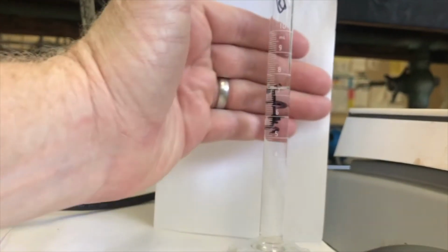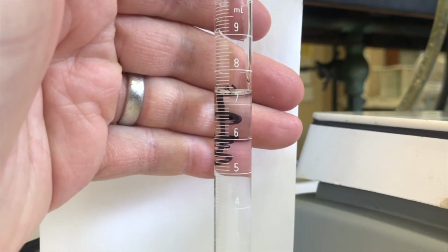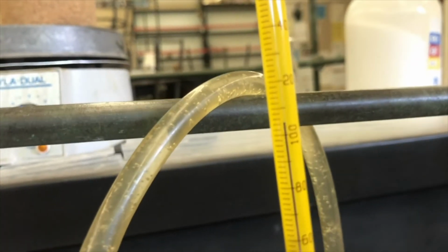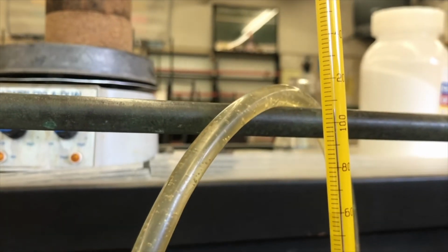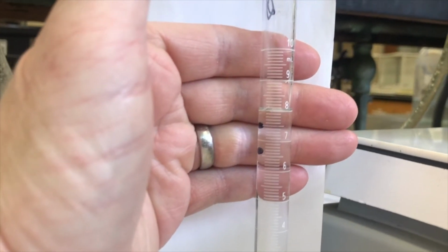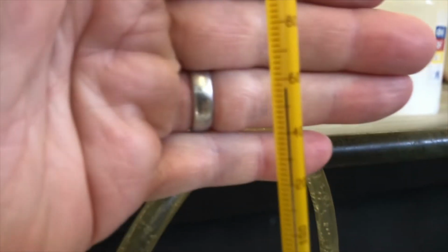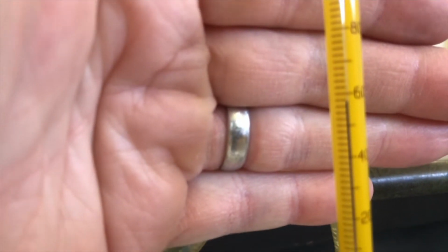95. Okay, 7.4, I'd say. And 104, say 105. No, that's 106, 106. Okay, about 8 milliliters, and the temperature is at 156 probably.